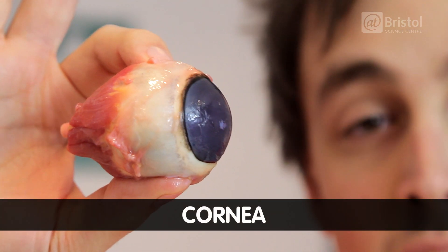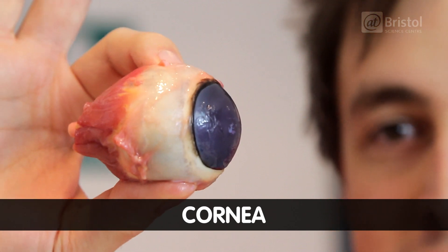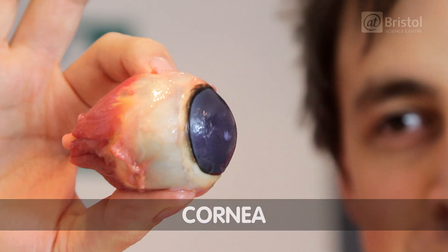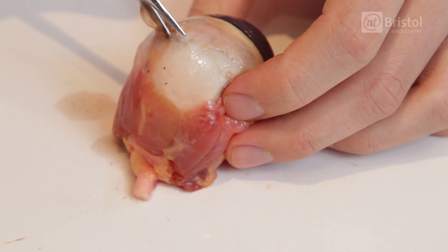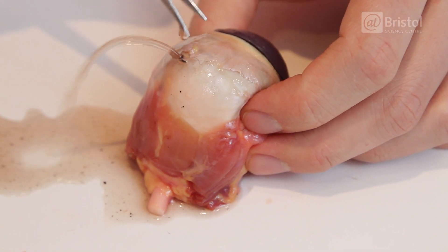So it's a bulge which sticks out, meaning the eyeball isn't perfectly round, but it gives an added layer of protection. And the white part here is called the sclera. And this is what we're going to be cutting into first.